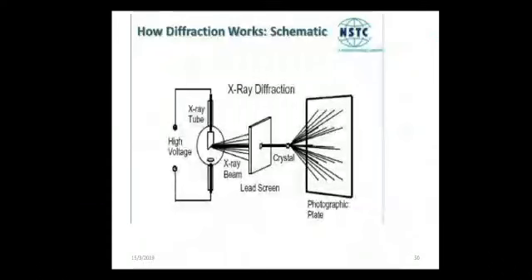And we can see a monochromator, which is used to absorb the undesirable radiations and allows the required wavelengths through. Here we are using a filter, zirconium, and crystals, lithium fluoride. The next one, mentioned in the sketch, is the crystals.